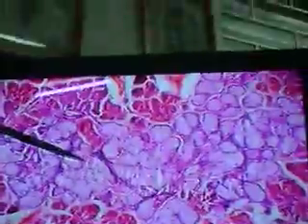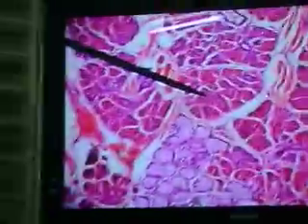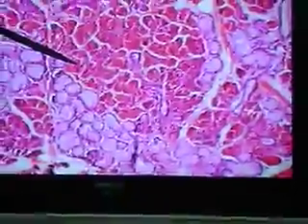Still more anterior two-thirds of the tongue. Alright, I'm not seeing those slides anymore, you can pass them over. So these are the serous cells, notice they're very acidophilic. Alright, so they're staining bright with eosin. Yeah, these are staining bright with eosin here.